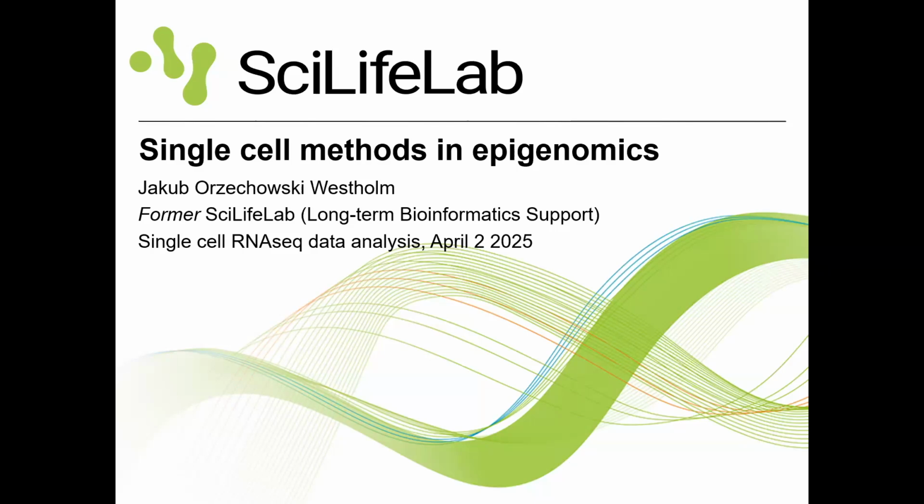Yes. Typically if you have something like ATAC-seq, or something very common like looking at histone modifications, then you get in the tens of thousands of peaks. You might get like 30,000, 40,000, 70,000 peaks.